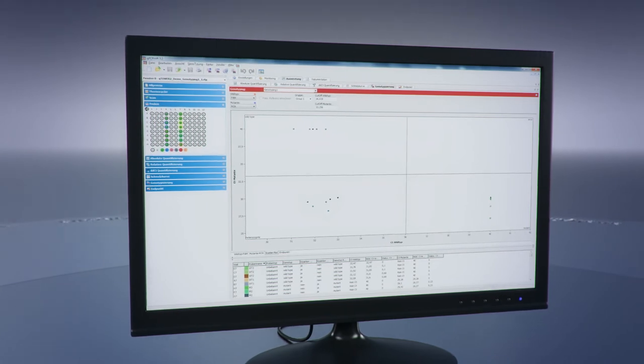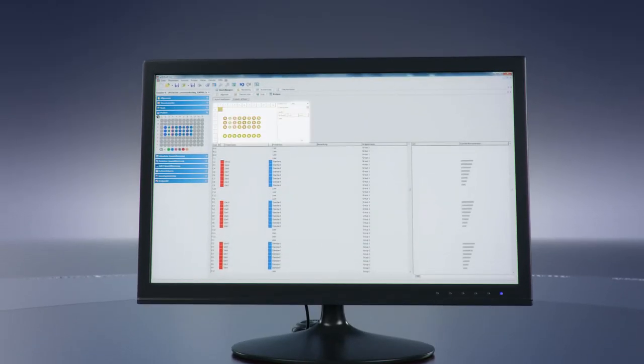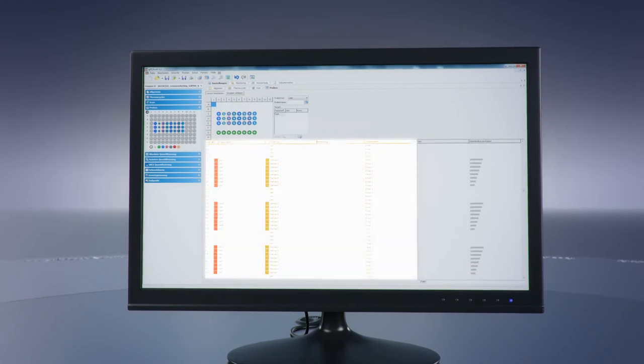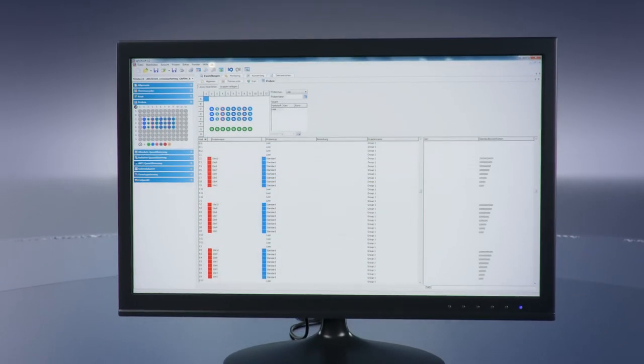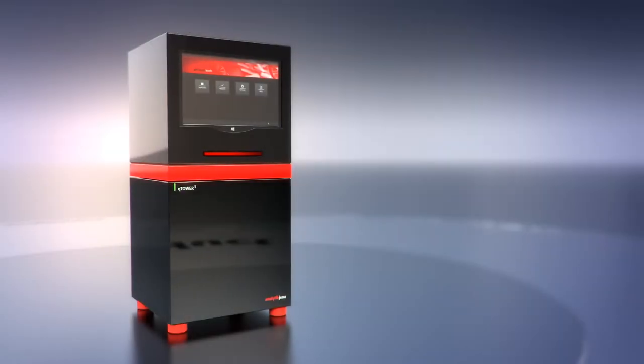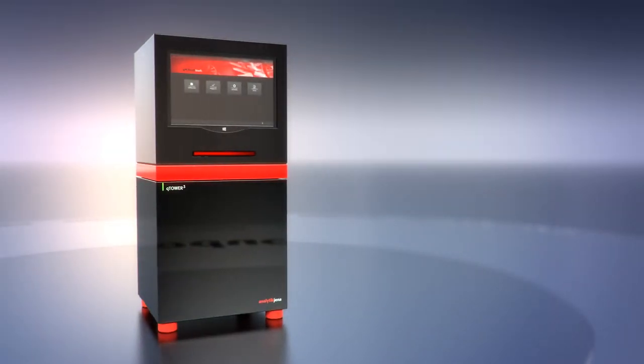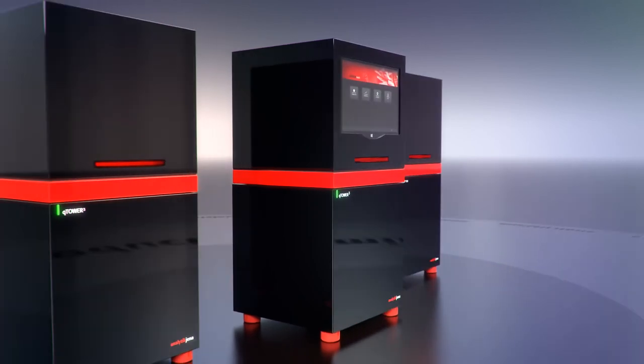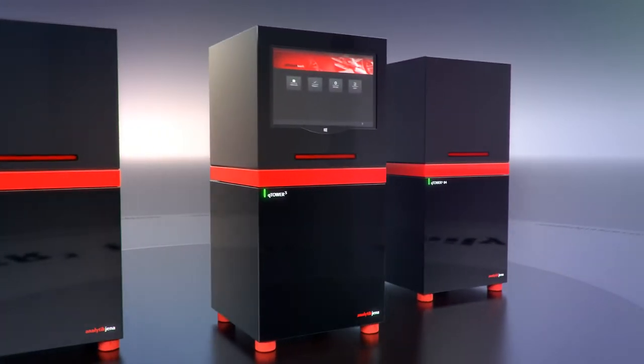The license-free software is designed to be both powerful and easy to use, offering numerous features including user management with three authorization levels, graphic-based setup of sample layouts, multilingual capabilities, results export functions, and MIQE-compliant documentation. With increasing sample volumes, the requirements for real-time PCR are changing. The shift to a multi-well format with 384 sample size opens up opportunities for new applications.